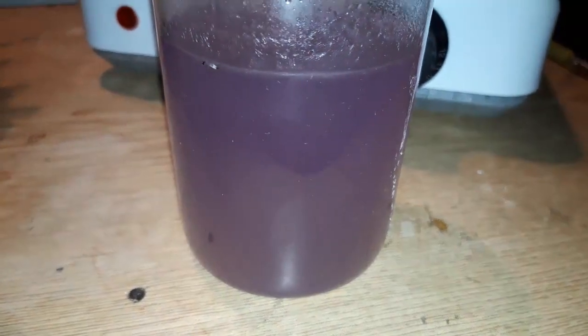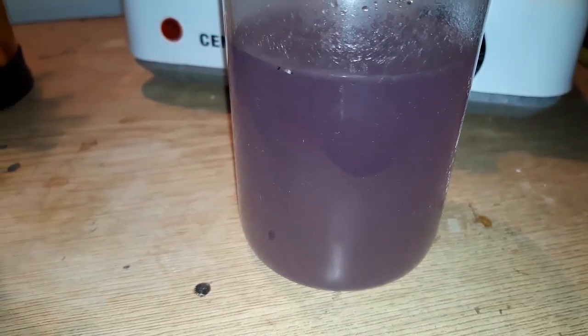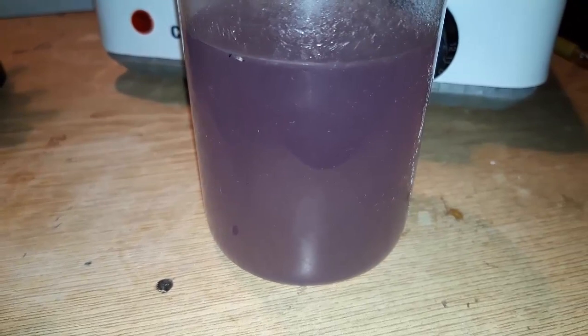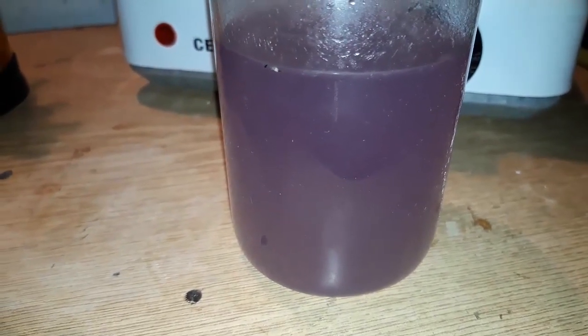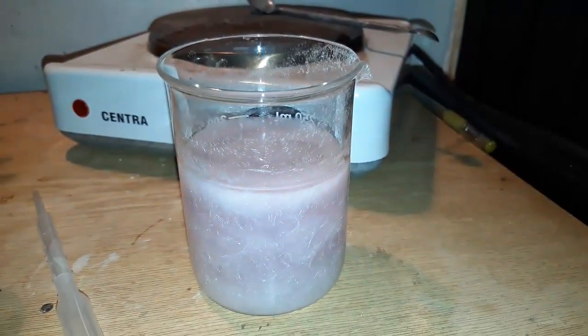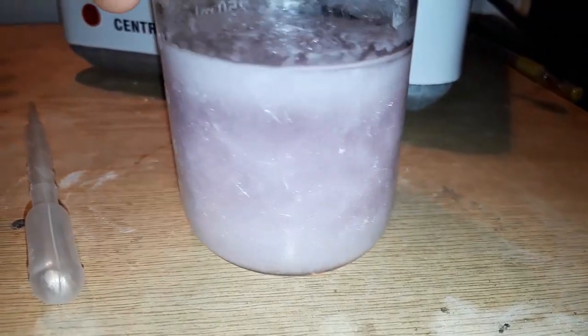After cooling it down to about 40 degrees, we put it in a refrigerator and let it sit there for about an hour. After an hour in the fridge, we can see a lot of small needle-like crystals fell out of solution.